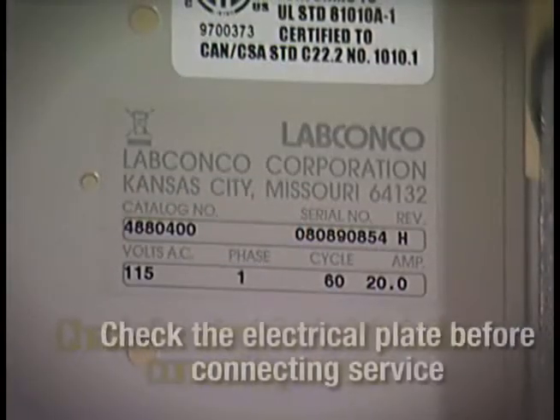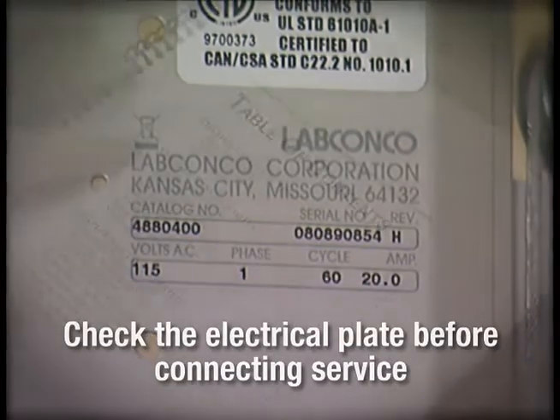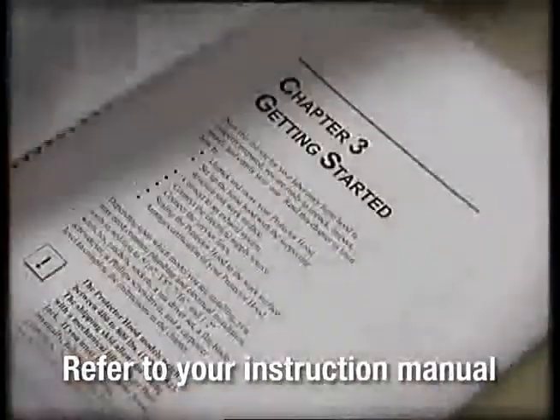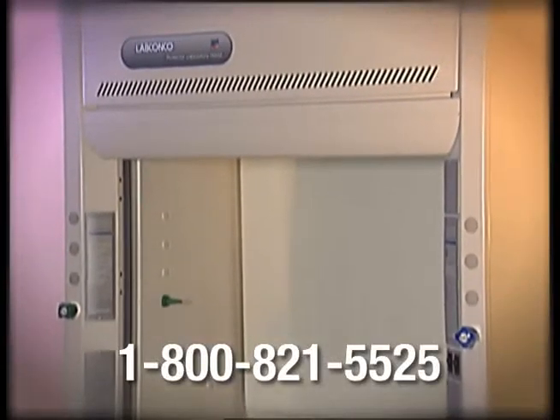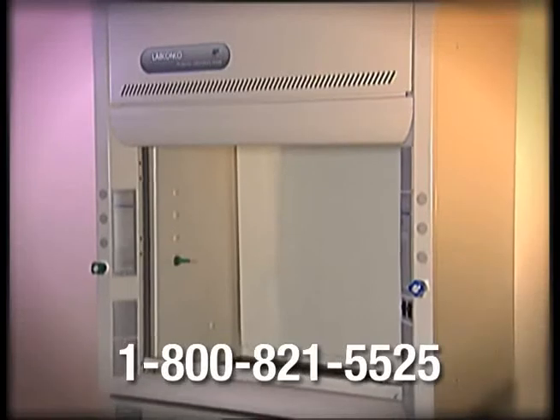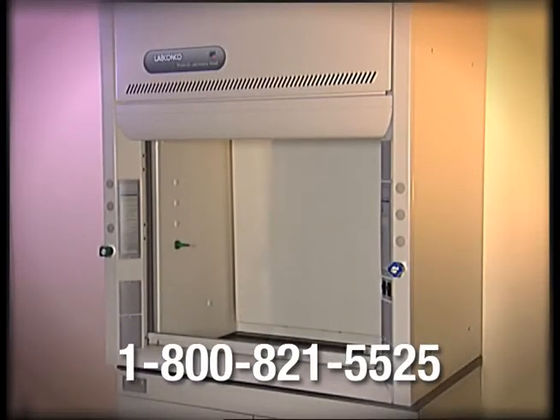Always check the electrical plate for information about your hood before connecting any electrical service. Refer to your instruction manual for complete installation instructions. For technical questions concerning fume hood installation, call a LabConco product service representative at 1-800-821-5525, from 8 a.m. to 5 p.m. Central Time.